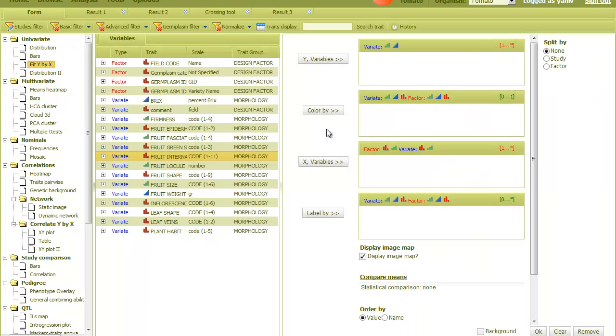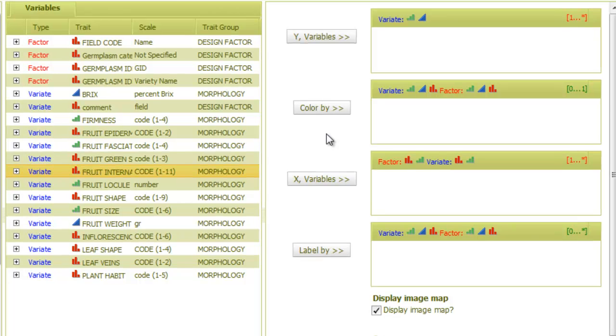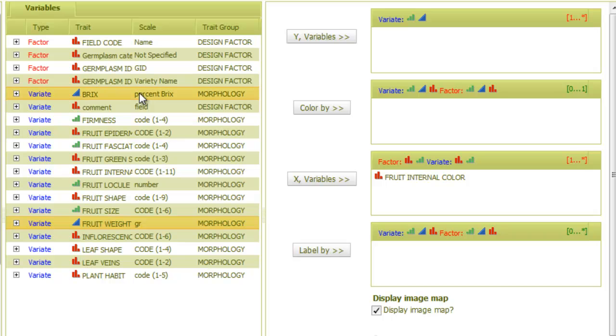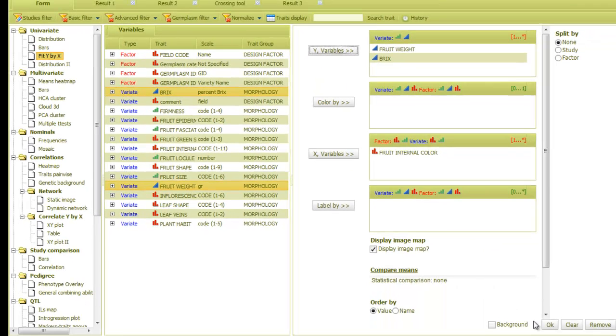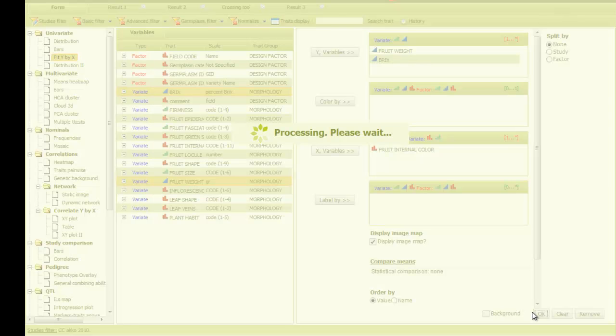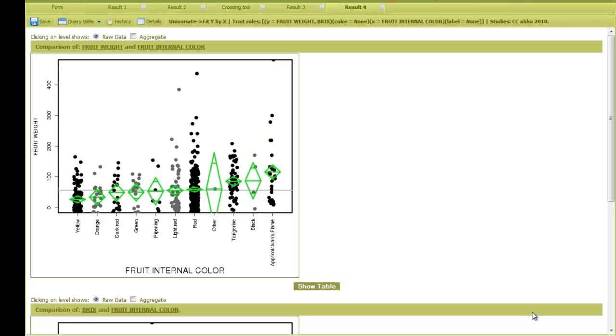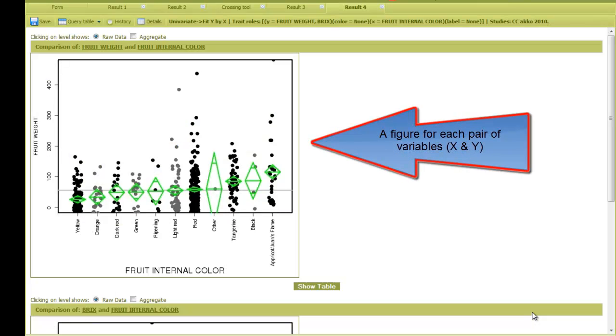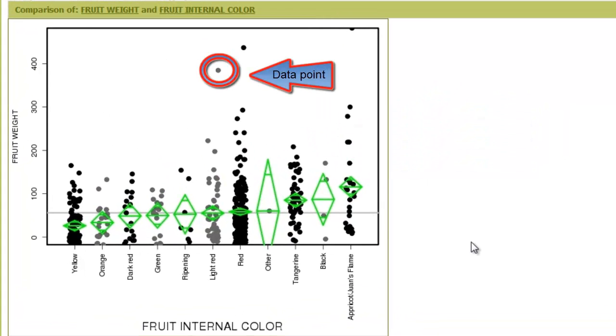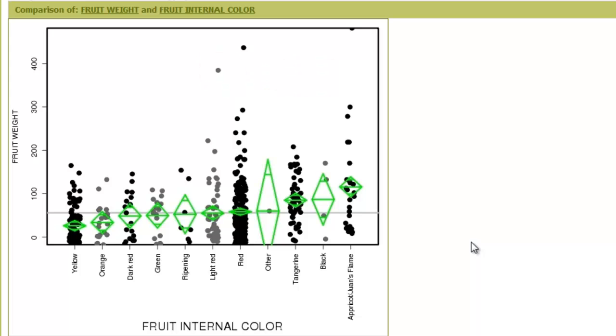Similar to what I did before, I'll put one red variable into X. Let's take this one, and then let's take two blue variables, which are continuous variables, into Y. Again, the result shows a figure for each combination of X and Y variables. Each data point represents a plant where its X value is its color category, and the Y axis indicates its fruit weight. The green diamond shows the category mean, and its height represents the confidence interval.